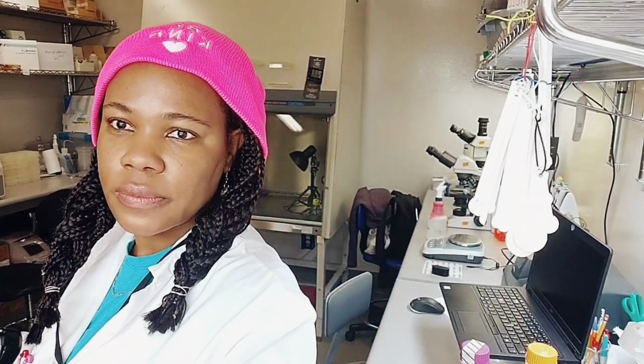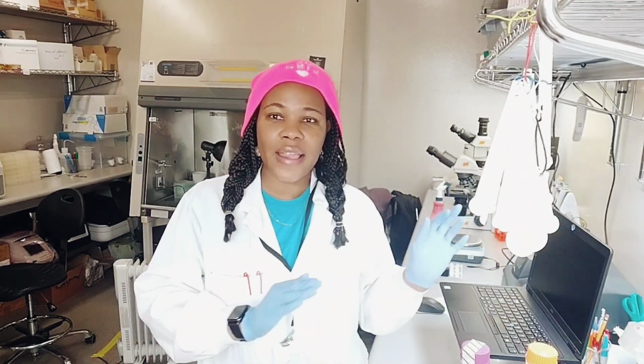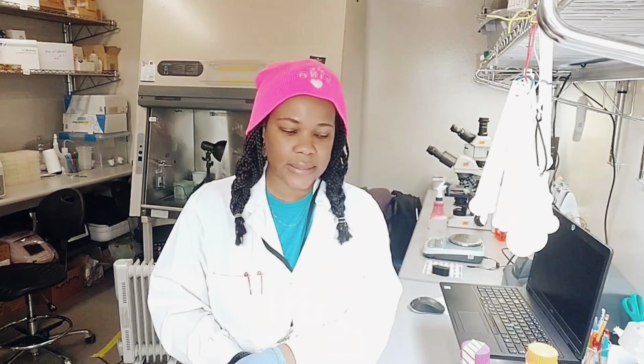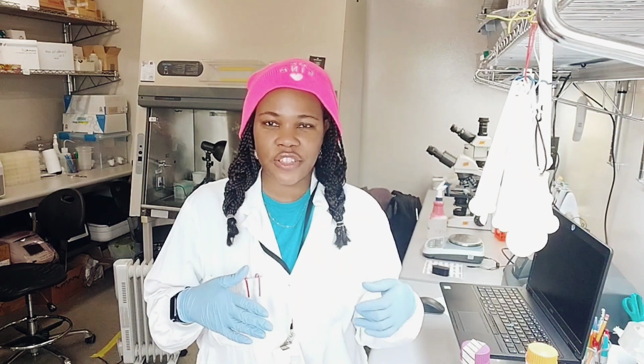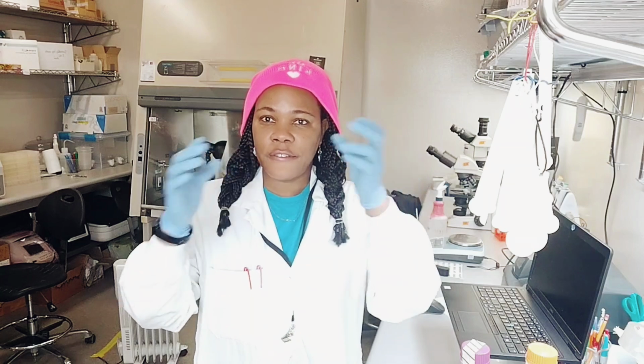Spray everything down with 70% ethanol, and then slowly put them into the BSC. Once I'm inside, you will see me prepare the inoculum. Essentially I'm going to add a certain volume of water to the plates, harvest the spores by gently scraping the surface of the plate, filter it, and keep doing that until I have the 1000 ml. And once that's done, I will QC.